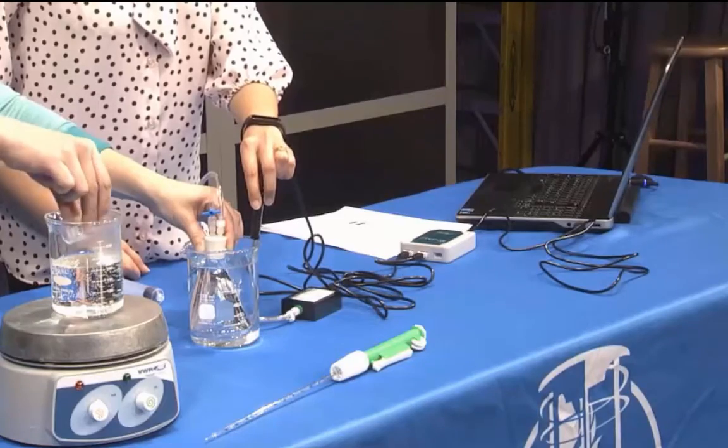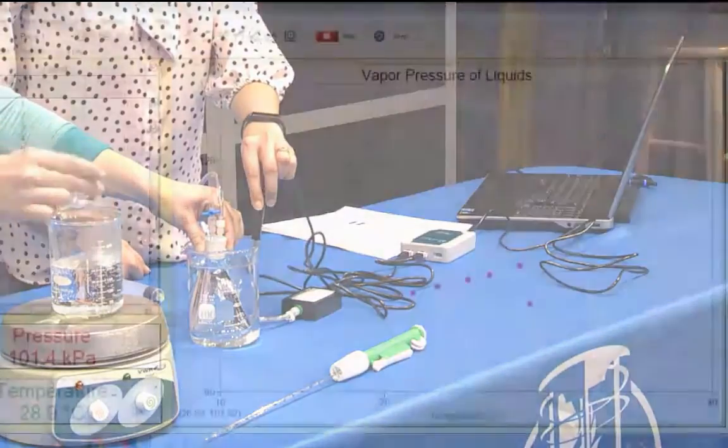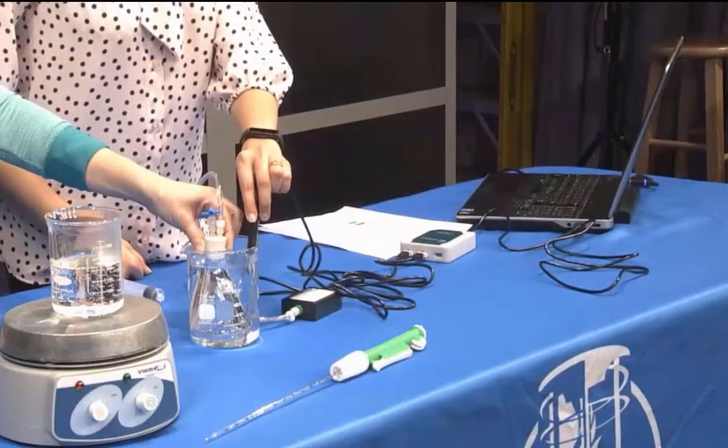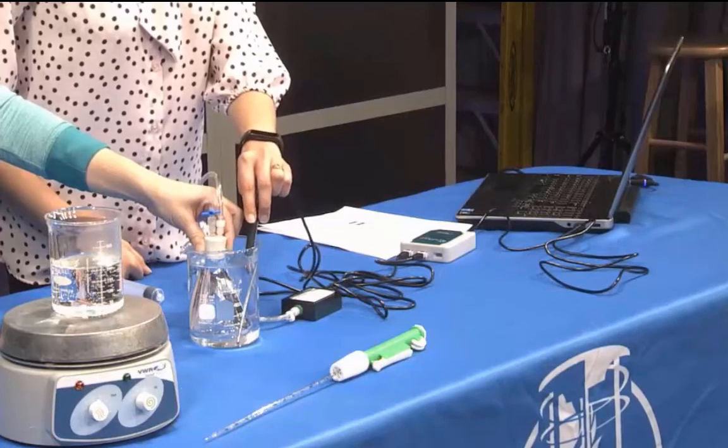Keep adding hot water until you have completed five total trials. Add enough hot water for each trial so that the temperature of the water bath increases by 3 to 5 degrees Celsius, but do not warm the water bath beyond 40 degrees Celsius because the pressure increase may pop the stopper out of the flask. If you must remove some of the water in the bath, do it carefully with a pipette so as not to disturb the flask.